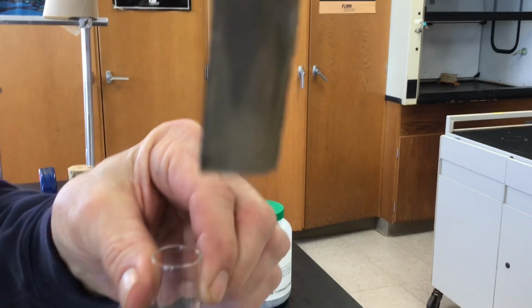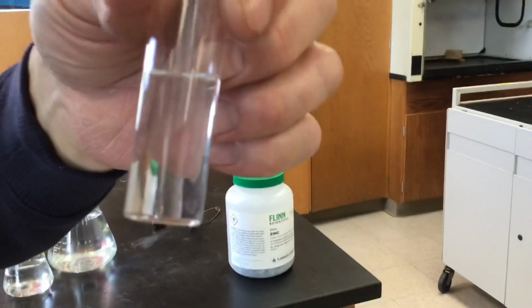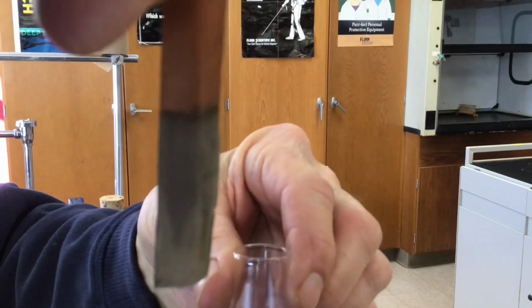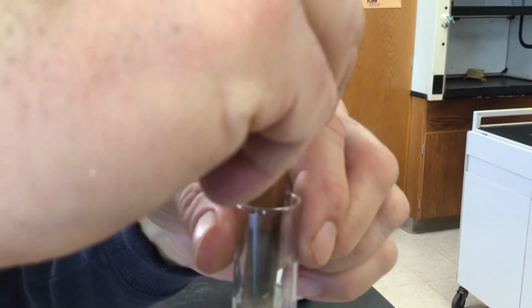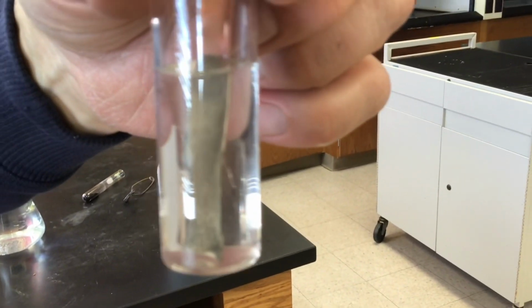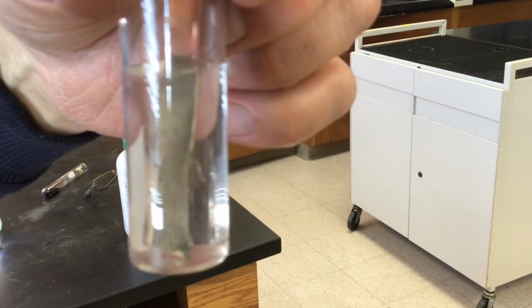Sometimes the solution changes color. It looks like the solution didn't change color on us. Not really. Not yet, anyways. Maybe we can leave it in a little longer and see what happens. So it's the copper and silver reaction. Right. Step 4.